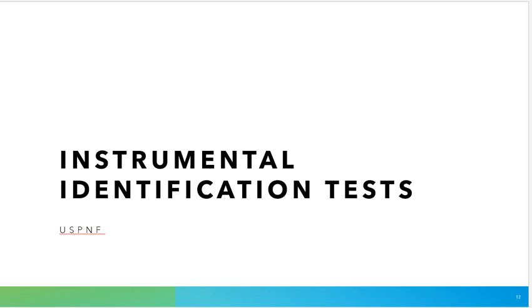Next up are the instrumental identification tests, and that's where I'm going to stop this video. So in the next part of this video, we're going to talk about the instrument piece in a little bit more detail. We're going to look at some of the equipment that might show up here. Maybe it's not an all-inclusive list, but we'll at least briefly mention a few things that are going to show up that we need to be comfortable with under the instrumental portion of the identification test.